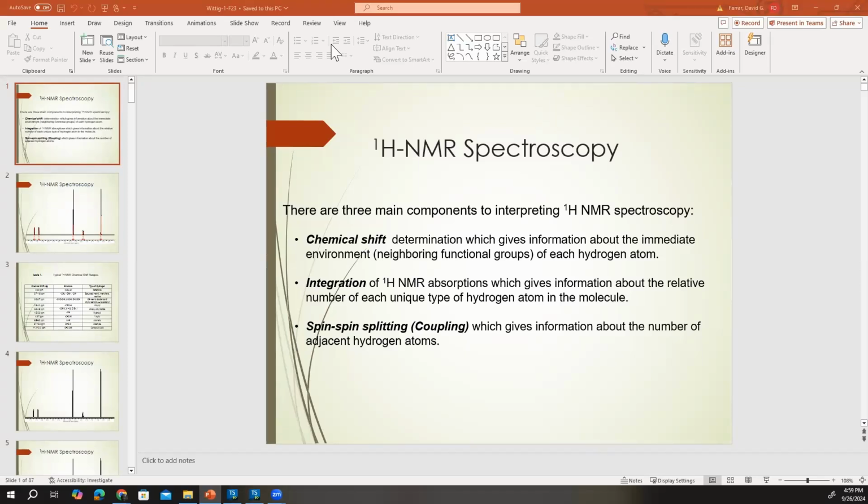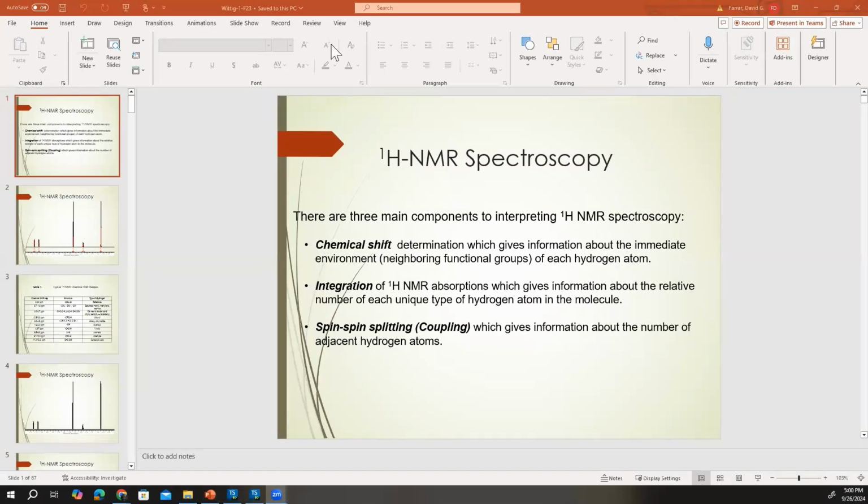Good evening to everybody. I'm going to start with a quick recap of just NMR spectral interpretation, and then we're going to go into specifically how to calculate the chemical shifts and coupling constants for the alkenes so that you can do your stereochemical determination for the product. And then we'll talk about what needs to be in the report, and that should finish it.